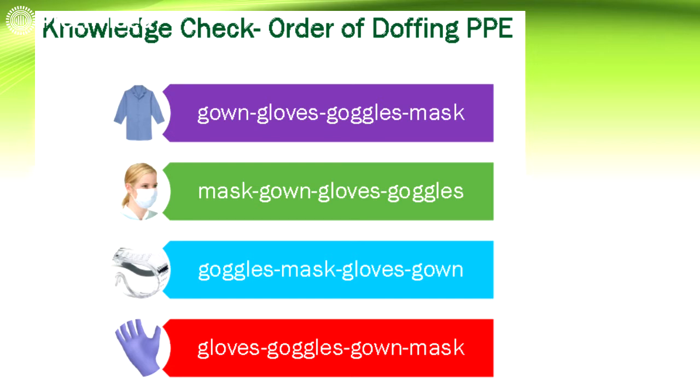Then, kapag nawala na yung gloves, wala na yung pinaka-source of infection, then, pwede mo nang tanggalin yung goggles mo, followed by the gown, and then last yung mask. Bakit last yung mask? Kasi nga naman, just in case may mga natira pang microorganisms sa lab gown mo, then, hindi mo siya masisinghot pag nagliparan yung mga yan when you remove your PPE.